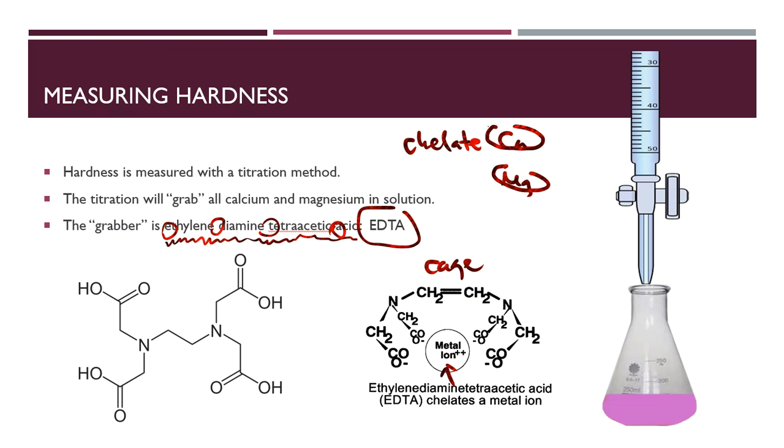Because this is the process of chelation. And sometimes we'll just call this a complex because it is a complex molecule dynamic that we have on our hands. It's not really a bond. It's not really a change in the reagents. We've not really made anything new. They just kind of like to hang out together. They're almost like BFFs. They're BFFs that have caged each other into each other. I mean, it's pretty much what's happened here.